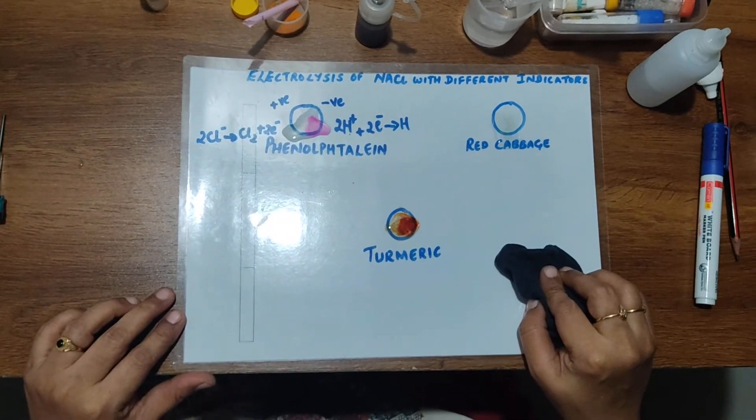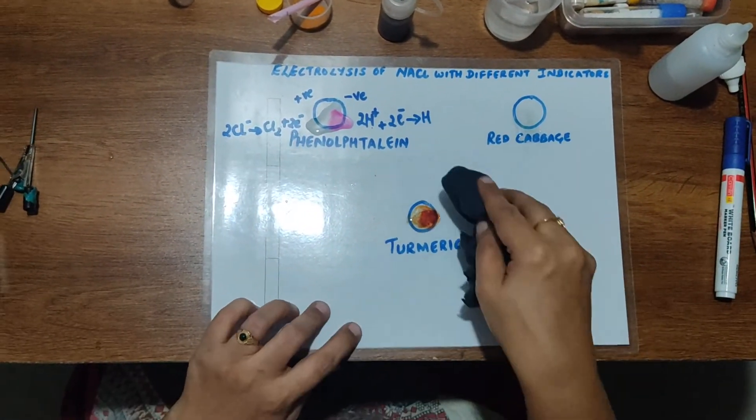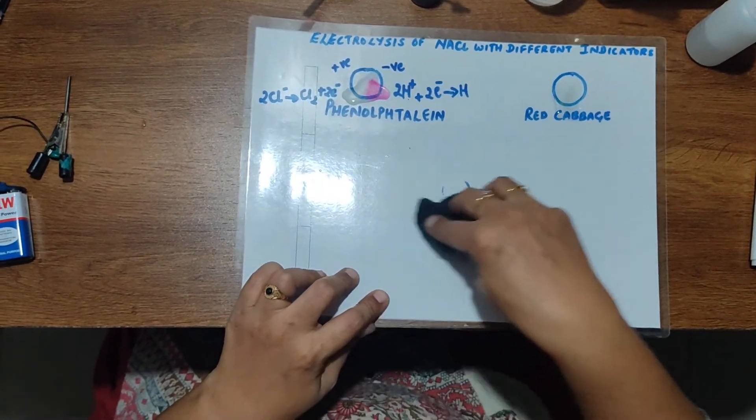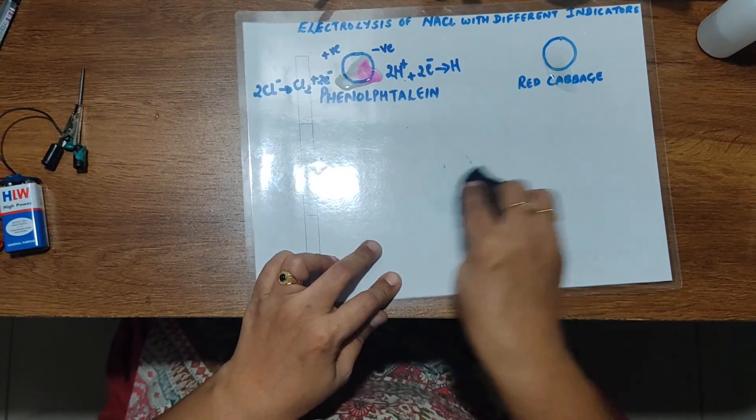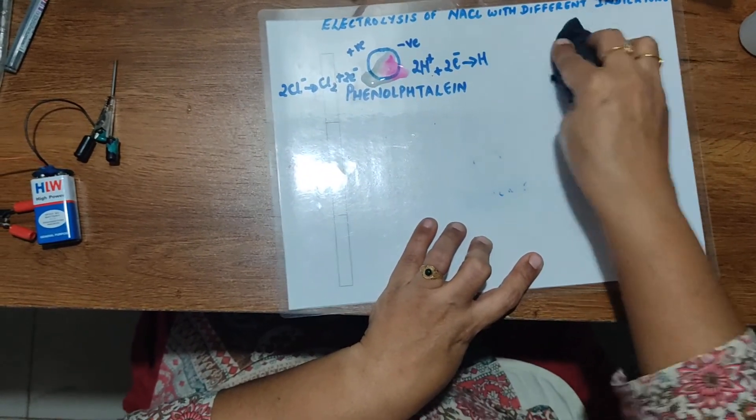Now that you have seen the simple electrolysis reaction, you can clean this laminated sheet just using a piece of cloth, and then the laminated sheet would be ready for the next experiment.